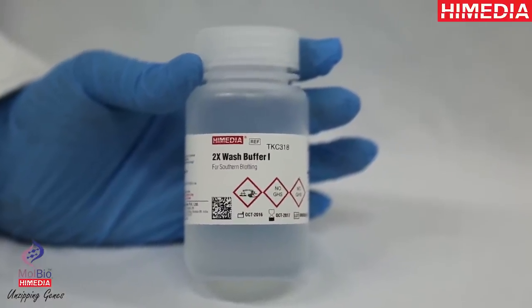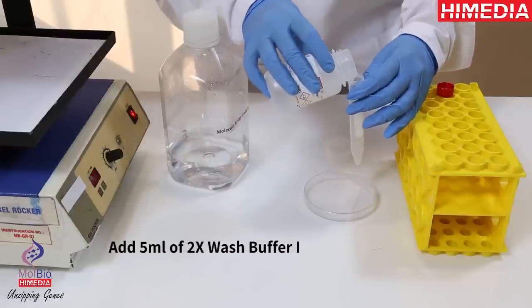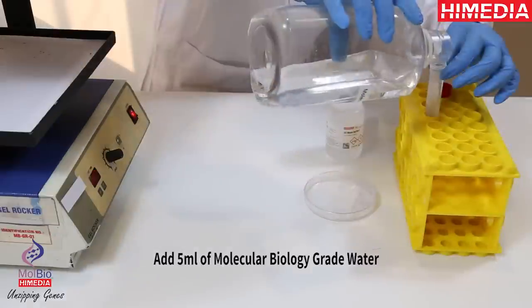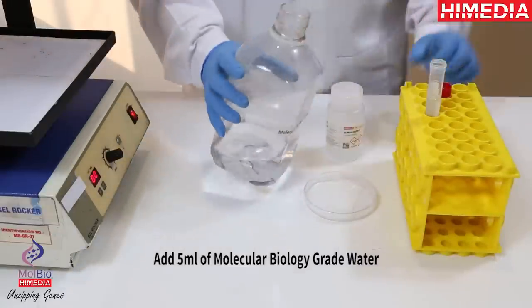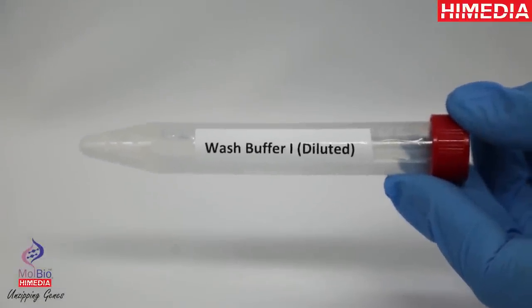Wash buffer 1. Add 5 ml of 2X wash buffer 1. Add 5 ml of molecular biology grade water. Wash buffer 1 diluted.